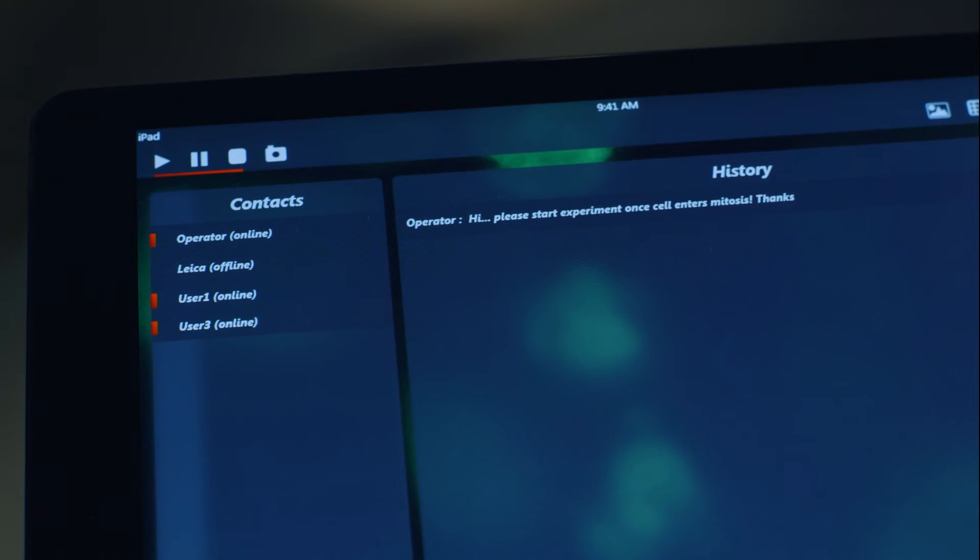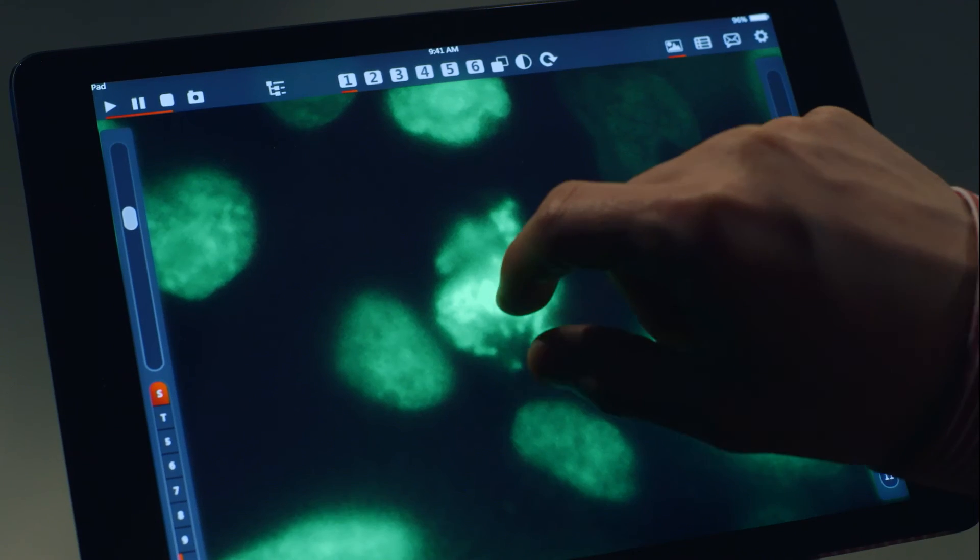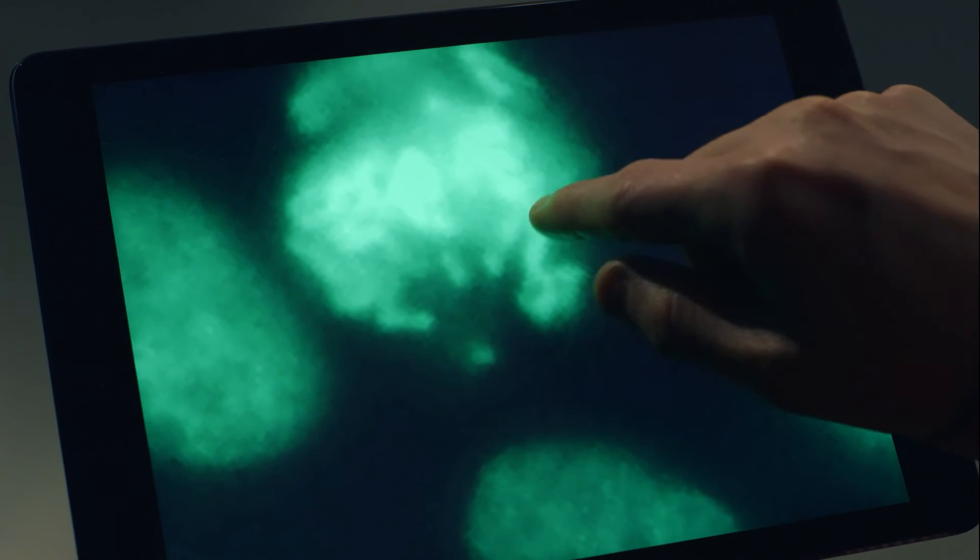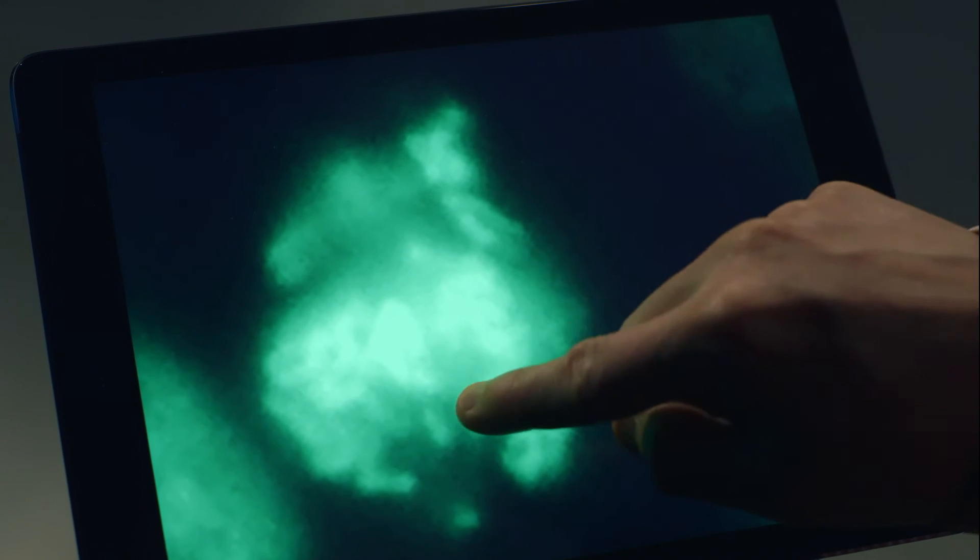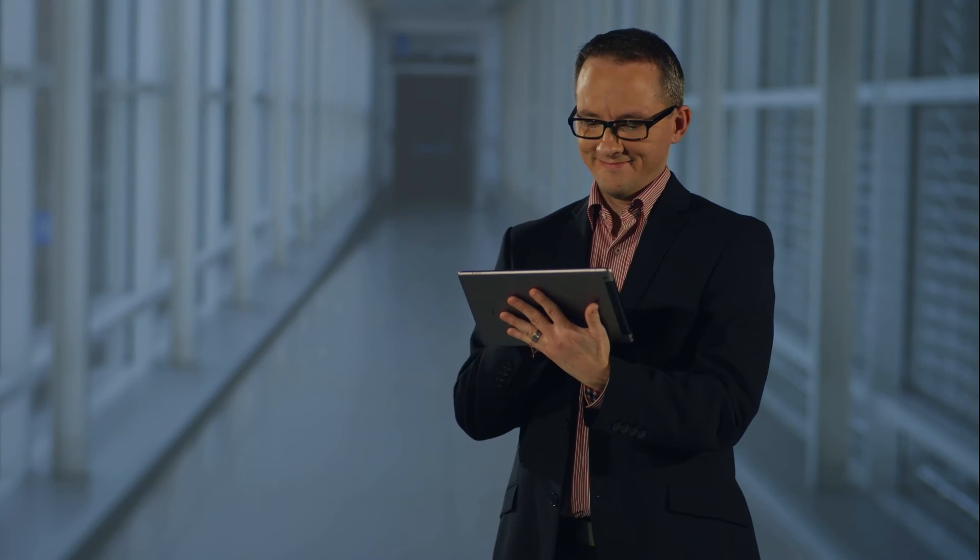Start, pause or stop experiments or capture an image to identify the best time for starting your experiment remotely. The imaging conditions are displayed on your remote device.